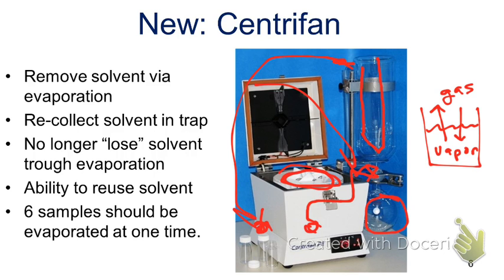Okay? So as our reaction's occurring, what's happening to the gas as it's formed? It's being removed. Well, this is an equilibrium reaction, so what ends up happening to the vapor, or your liquid? Should have written that better. What does your liquid do according to our equilibrium principles?